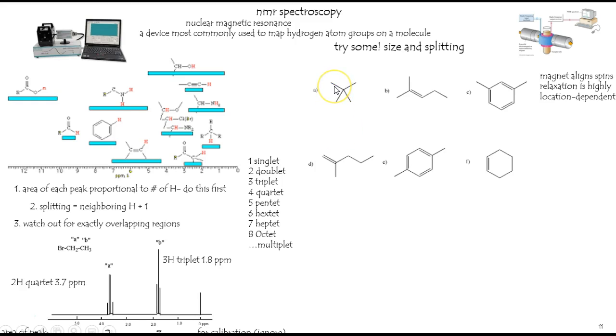But hopefully you'll see the substance, I believe this is called neopentane. That's a CH3, CH3, CH3, CH3. And since it's just a quaternary carbon with no hydrogens in the center, there's no splitting anywhere. Every single one of them is a 3H singlet. Try that for this one. This is CH3, so it's 3H.